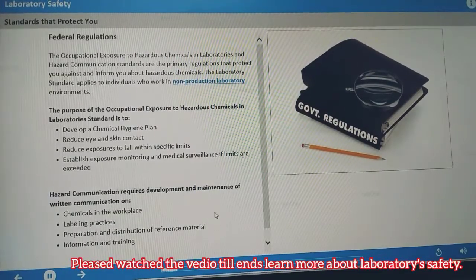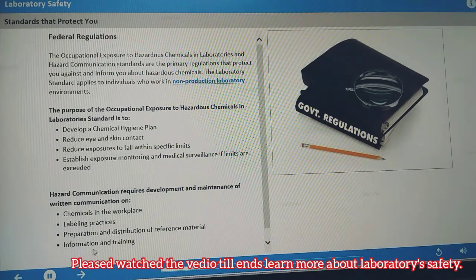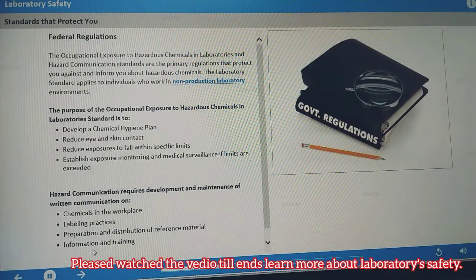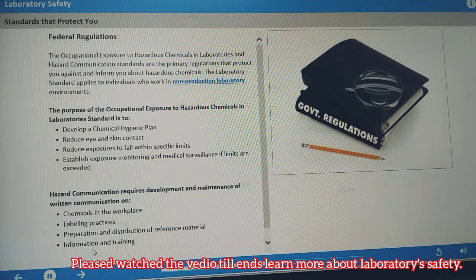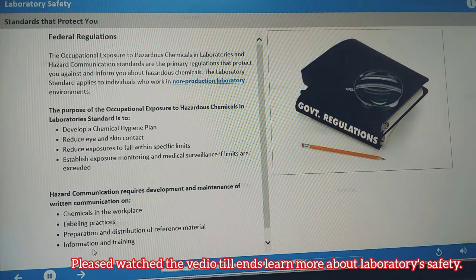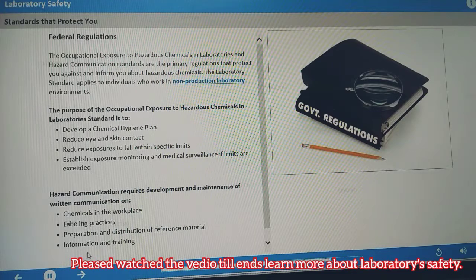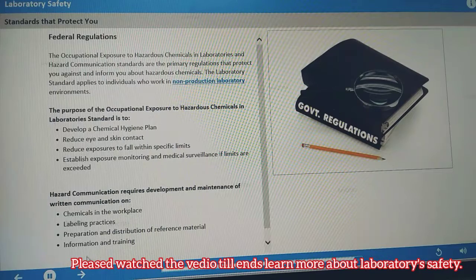The Occupational Exposure to Hazardous Chemicals in Laboratories and the Hazard Communication Standards are the primary regulations that protect you against and inform you about hazardous chemicals. The Occupational Exposure standard applies to all individuals who work in non-production laboratory environments and addresses the protection of workers against occupational exposures to hazardous chemicals. The Hazard Communication Standard requires the development and maintenance of written communication related to chemicals, labeling, reference materials, and training. In this lesson, you'll learn more about these requirements.